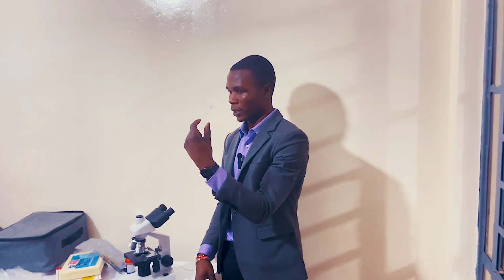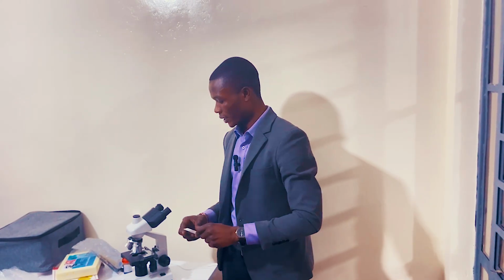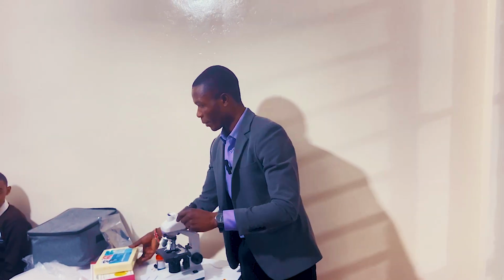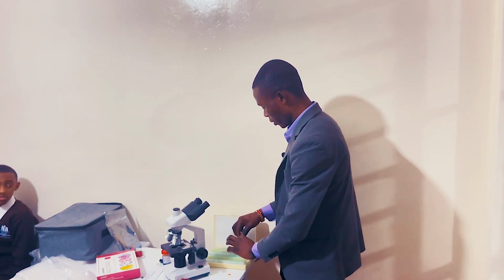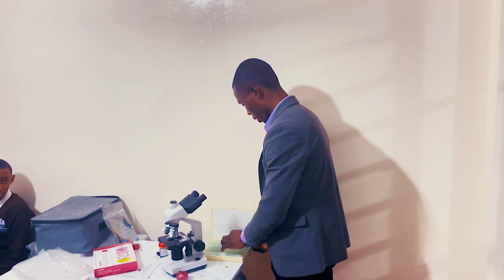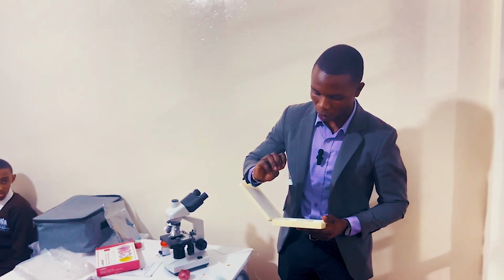So all the slides have the specimen to be viewed. Are we together? Now we are going to do this. We are going to come here, and under my guidance, do all the steps we have talked about. Then we view, so that at least each and every one of you can know what we are talking about. If we talk about magnification of using a microscope, so that at least you can be able to use it.